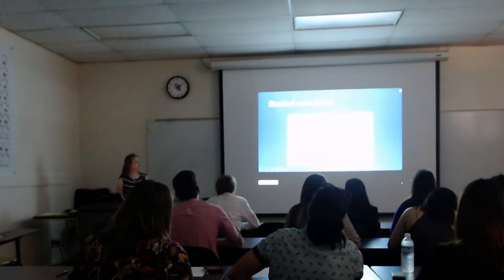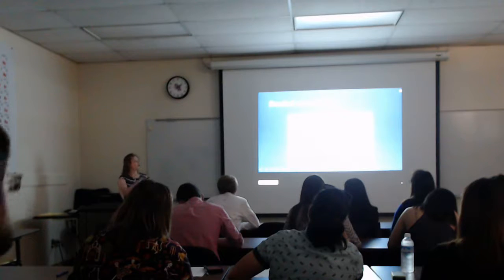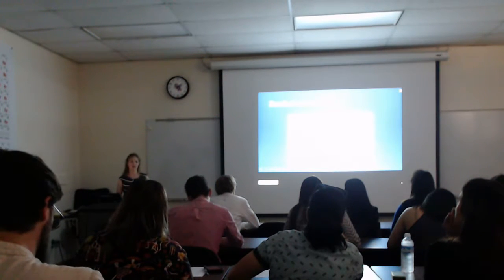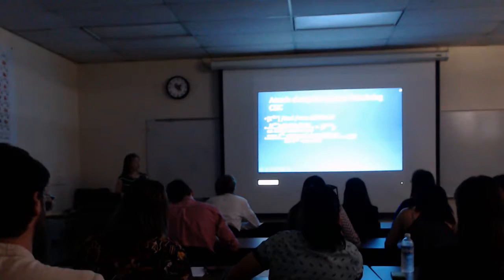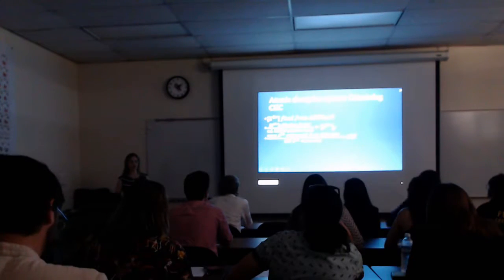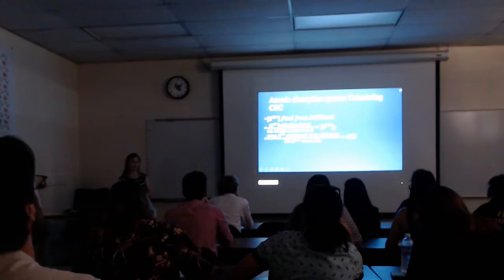And this is our standard curve for the AA. And if you are not using a software that will give you your final concentration, you can again use the absorbance into your slope-intercept form in order to determine how much of the ion was left in solution. Then you have to take into account your dilution factor, and once you take into account the dilution factor, you're able to determine CEC. Because we use a software that gives us our final concentration, we didn't have to plug it into our standard curve, but it's still necessary to have standards when using any of these spectroscopic methods to ensure the instrument is calibrated correctly.